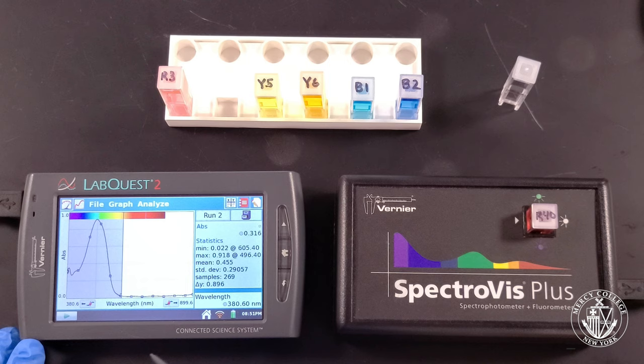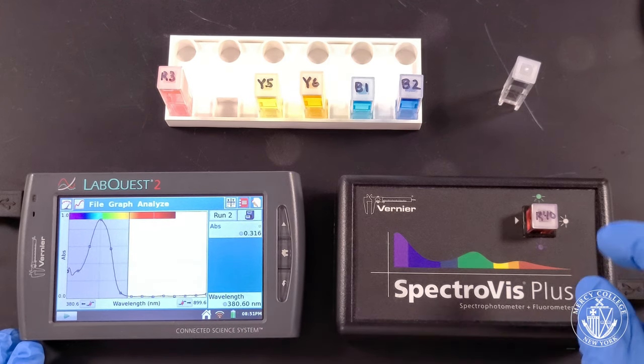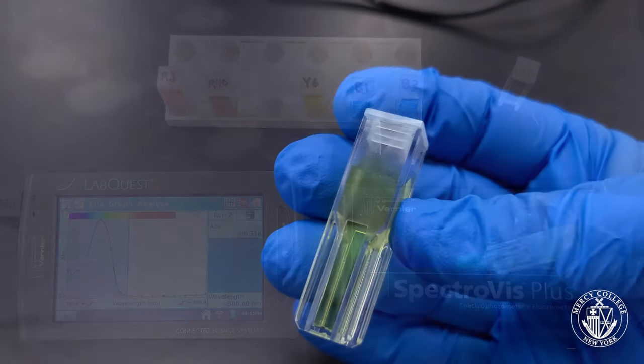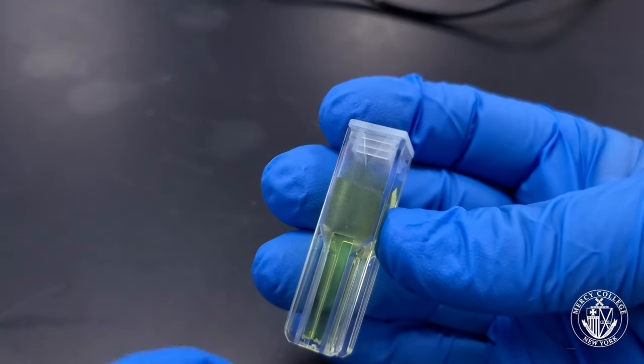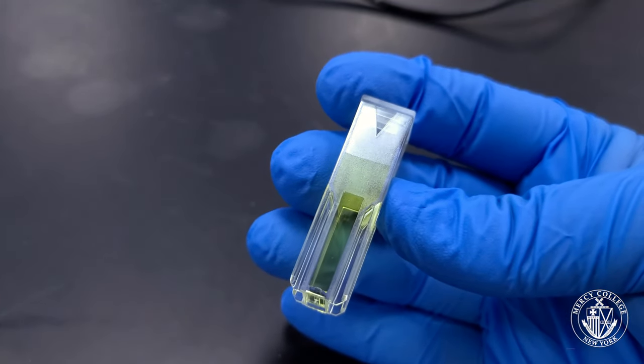Again select Statistics from the Analyze menu to clear the Statistics panel on the right. Remove your sample from the spectrophotometer and select another sample to analyze. Be sure to use gloves when handling your cuvettes. Dust or fingerprints can be removed using a chem wipe or soft cloth.